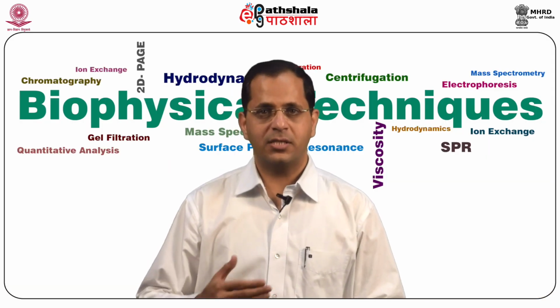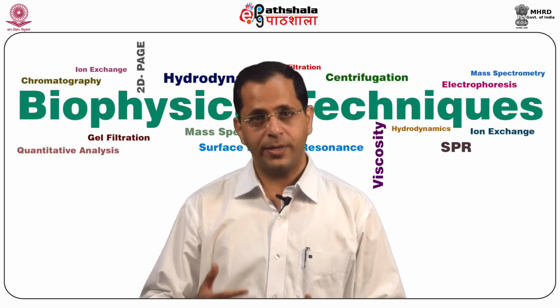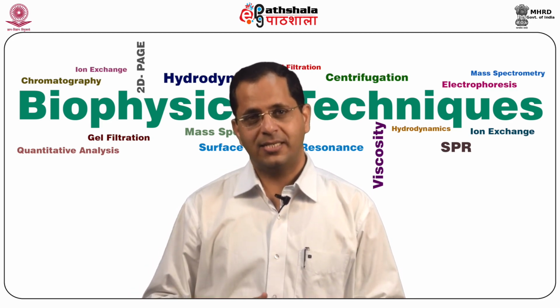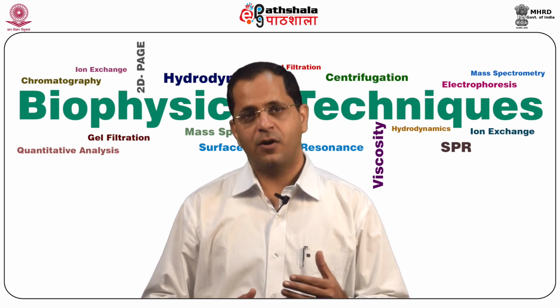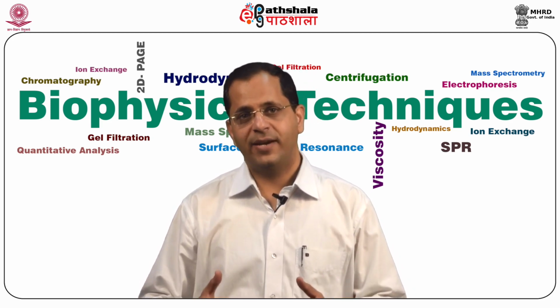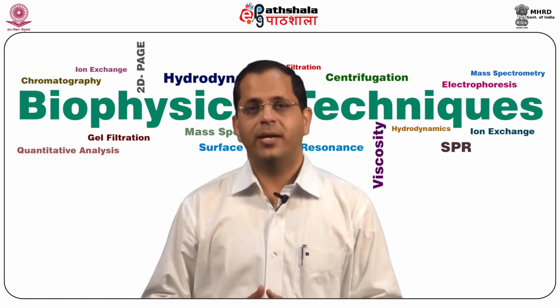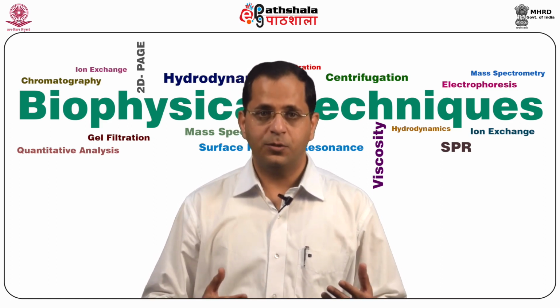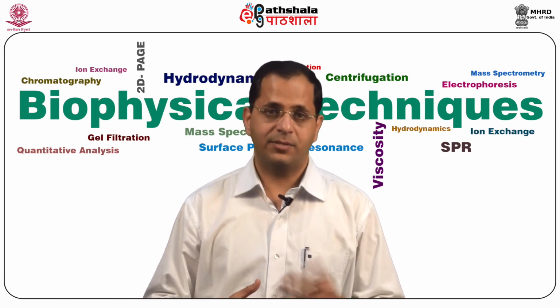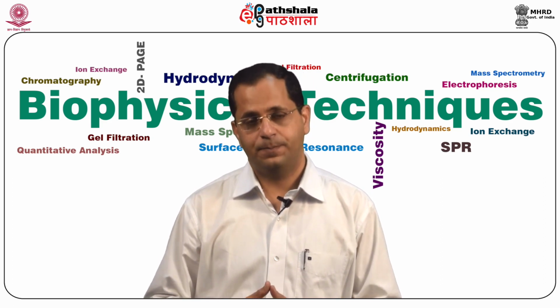2D electrophoresis is a method of separating and identifying proteins in a sample by displacement in two dimensions, that is, using the parameters of the isoelectric point and the molecular weight at right angles to one another. This could be used for analysis of complex protein mixtures extracted from cells, serum, tissues, or any other biological sample.